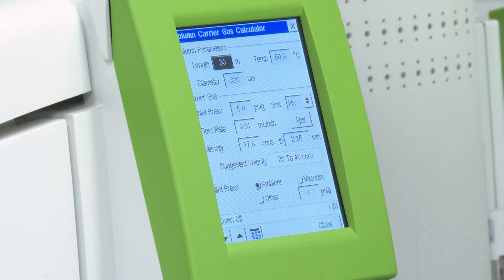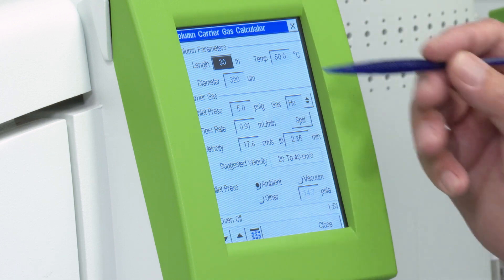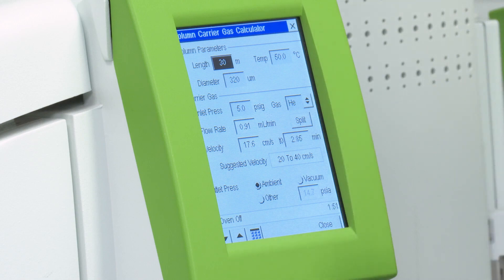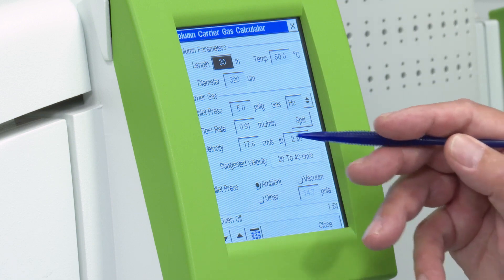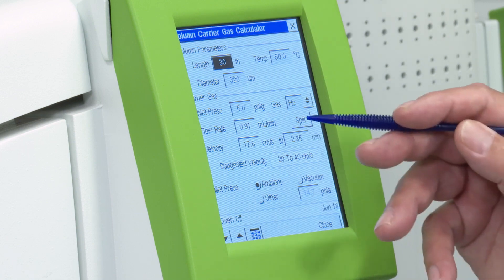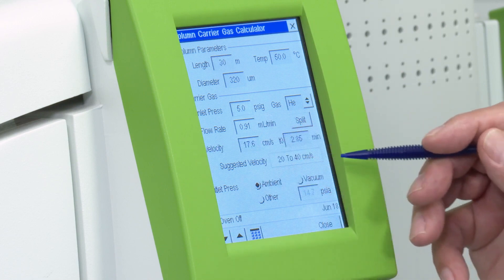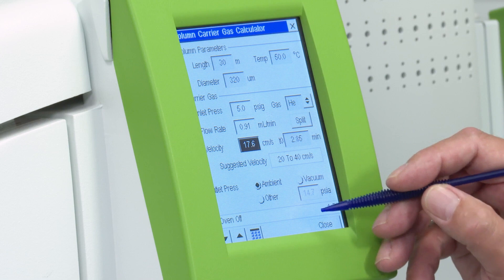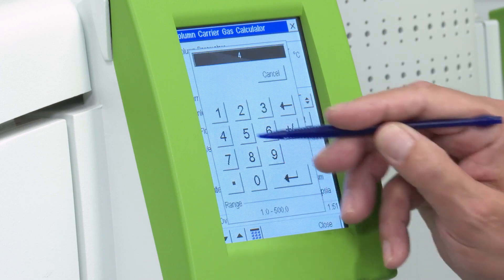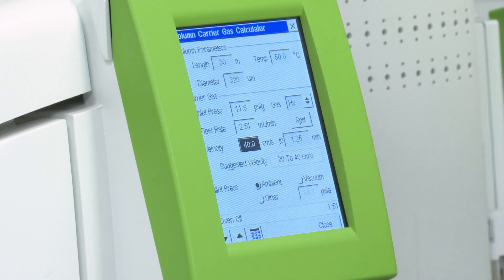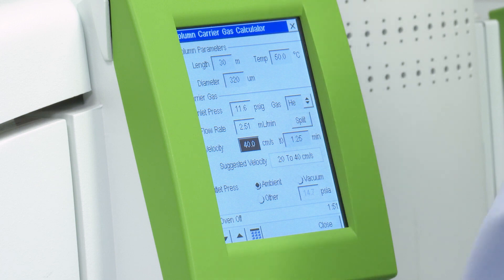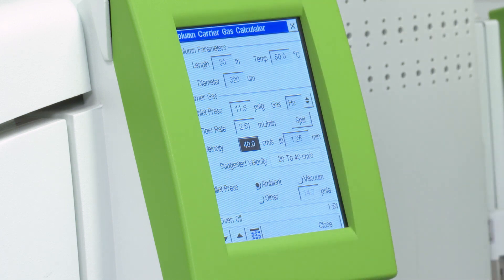Those parameters are pressure, flow, and linear velocity. So let's put in a couple of them right here. We'll just leave the defaults of 30 meters, 50 degrees C, and 320 microns. But what we want to know is what pressure or flow gives us the best separation. There's a suggestive linear velocity of 20 to 40. Let's say we'll put in 40 because we want to be efficient but go as fast as we possibly can. And for this particular column set, that translates to a flow rate of 2.51 mLs per minute.